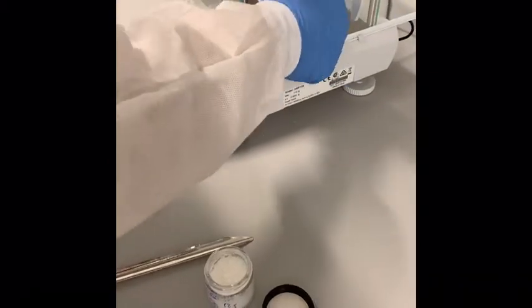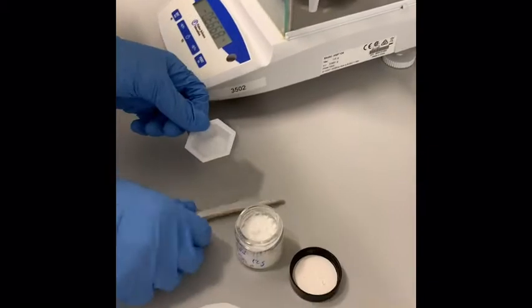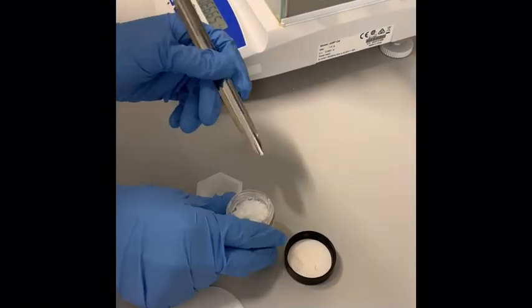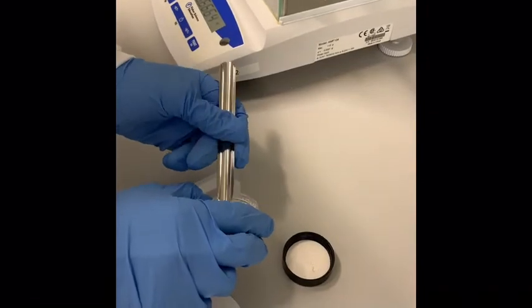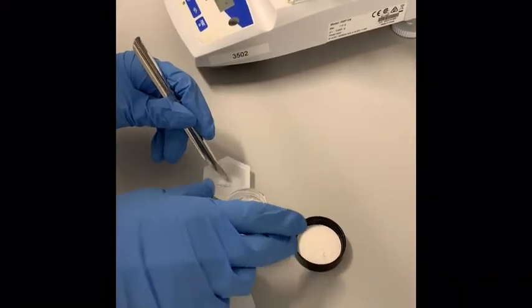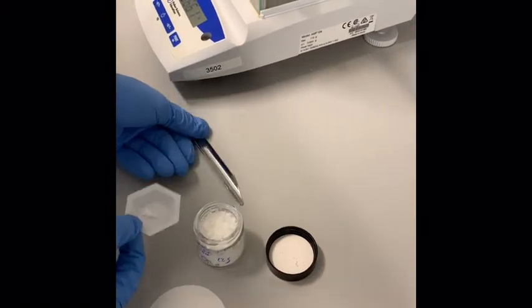We're shooting for 0.2 grams, but as always it's more important that you write down exactly what you see. I'll just start with a small amount — I have no idea how dense this stuff is. Then you can leave it on the balance.